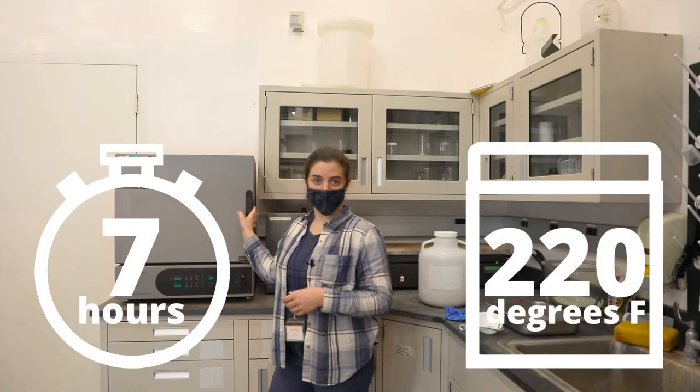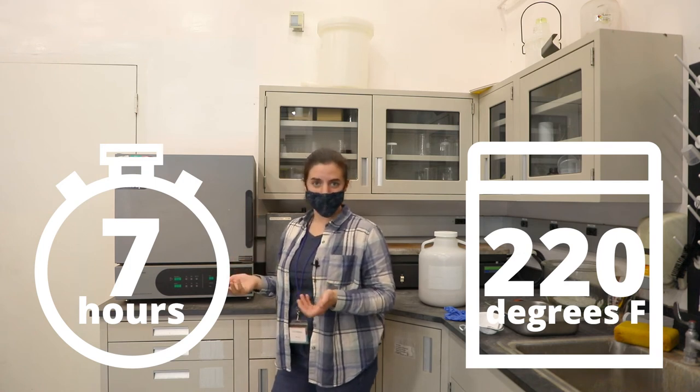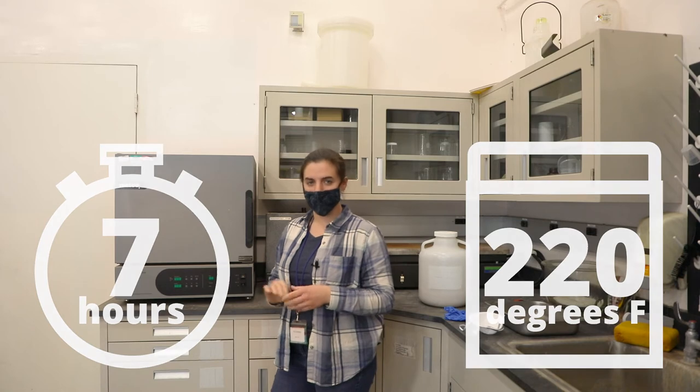It really depends on what kind of oven you're using to regenerate your silica — it might be more or less time than seven hours. You just have to keep an eye on it and see how it's cooking. Make sure it's cooking evenly throughout the tray.